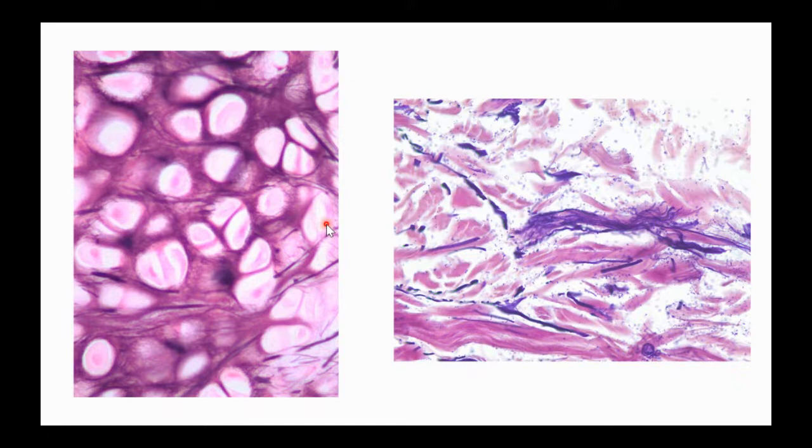We will talk about this in lecture in the next unit. They live together in little spaces called lacuna. So anytime you see these groups of cells that are together with each other, we are looking at cells called chondrocytes. Chondrocytes are found in all my types of cartilage tissue. So if you see these chondrocytes and they're surrounded by purple, like I see here, you are looking at what's called elastic cartilage. Elastic cartilage.